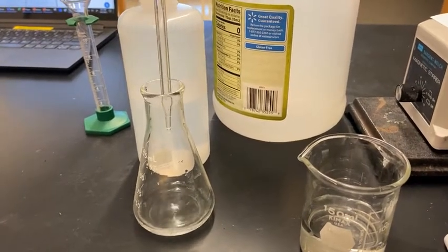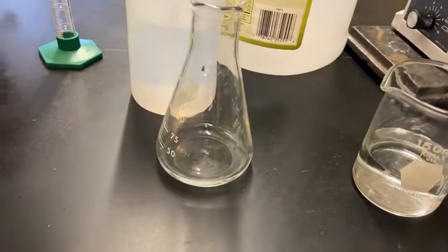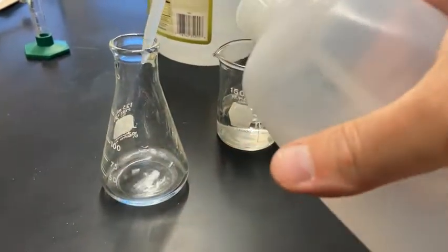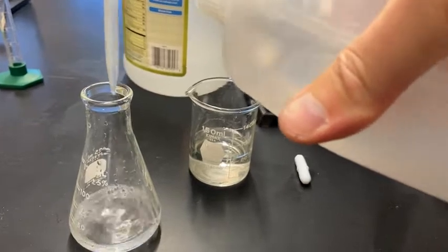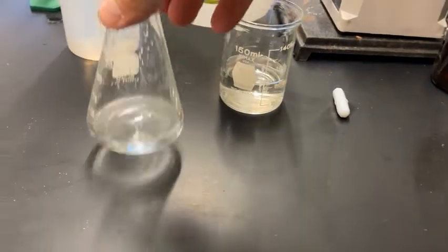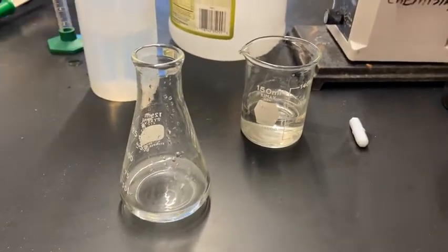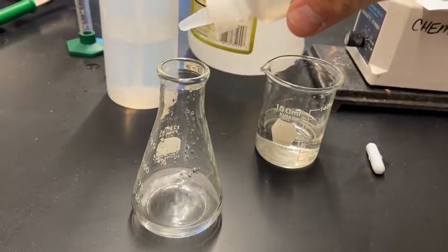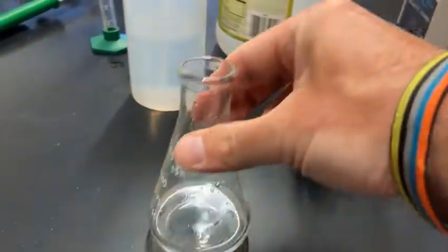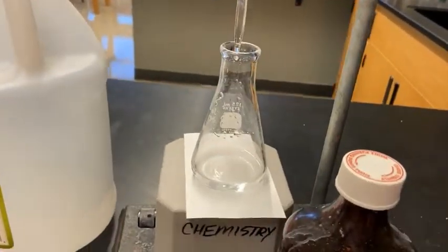It smells like vinegar — very exciting! I've dispensed the 10 milliliters of acid. Now I'm going to add some water — the lab says 10 milliliters of water. The water just gives us a little more liquid to work with; we won't use that volume in any calculations. Then the last thing is to add the indicator: two drops of phenolphthalein. Remember, phenolphthalein is clear in acids, and you can see that it is indeed clear in this acid.